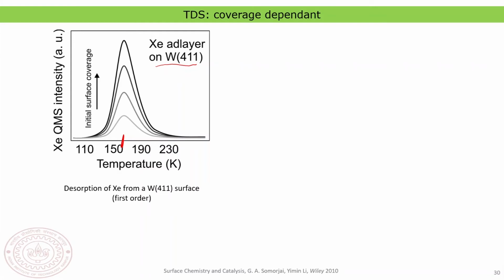Well, the reason is directly imaginable, because we have a surface which is more corrugated, therefore the reactivity of the surface is larger, and even for a noble atom like xenon you see the desorption temperature is high, which directly means that we have a higher adsorption energy or desorption energy. Now, something interesting, as I have already told you, we can do with thermal desorption spectroscopy is also look at the dependence and the type of kinetics of this kind of ad layer.